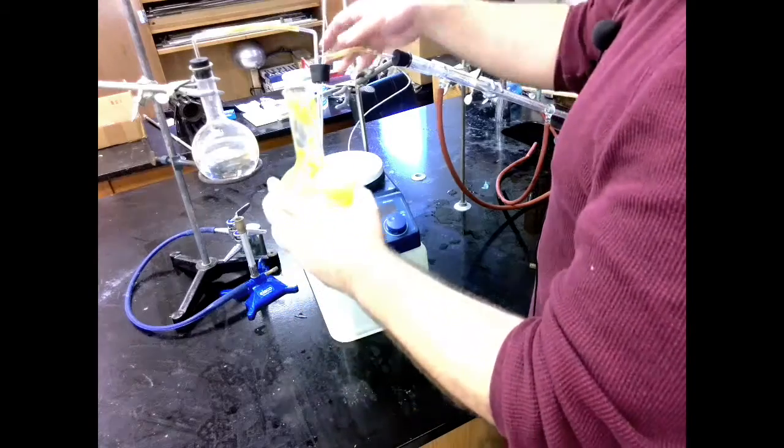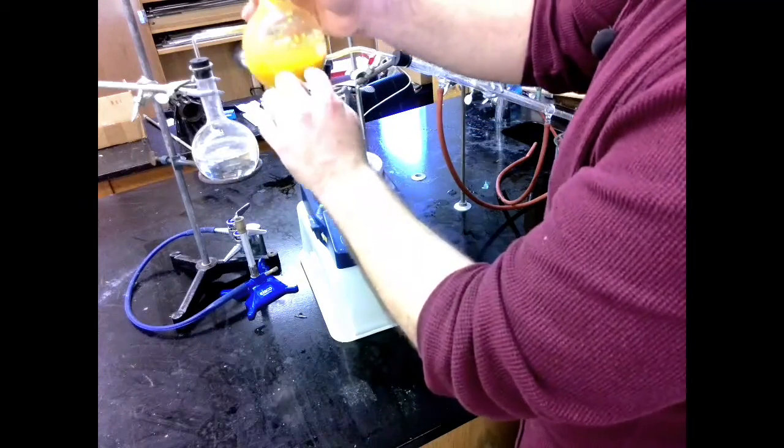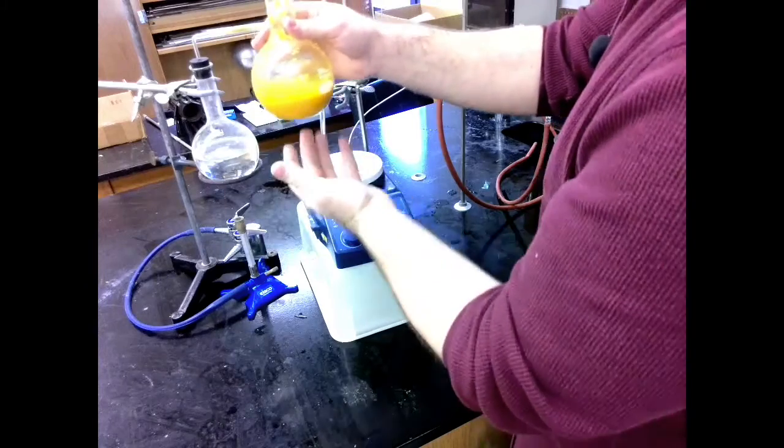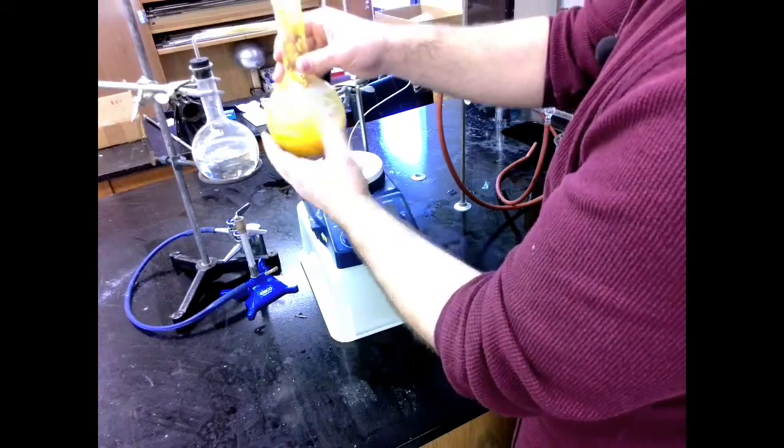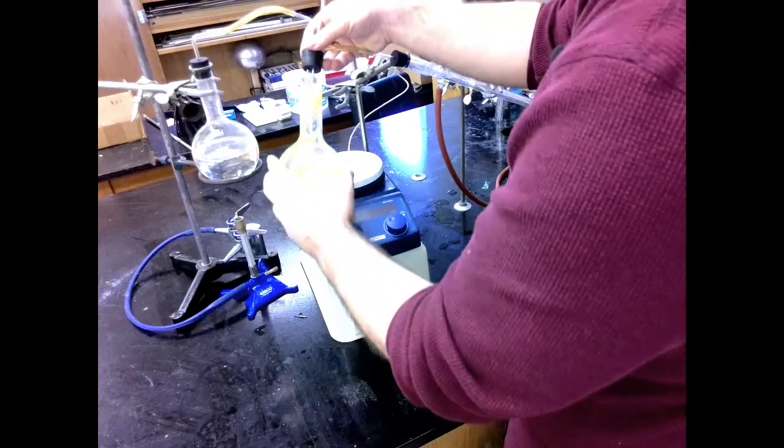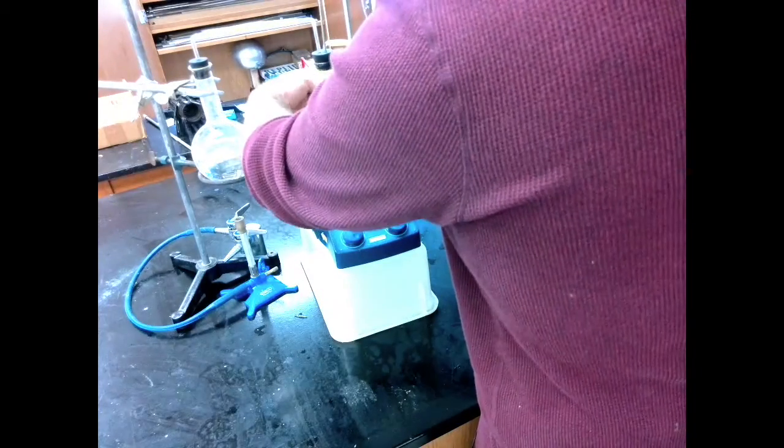I've got my Florence flask with my orange slurry here. This has a lot more water in it than yours will. I had this frozen from a few months ago. So that's where all the excess water came from. But I'm just going to put it on like so. Stick it in there. Get everything clamped down.